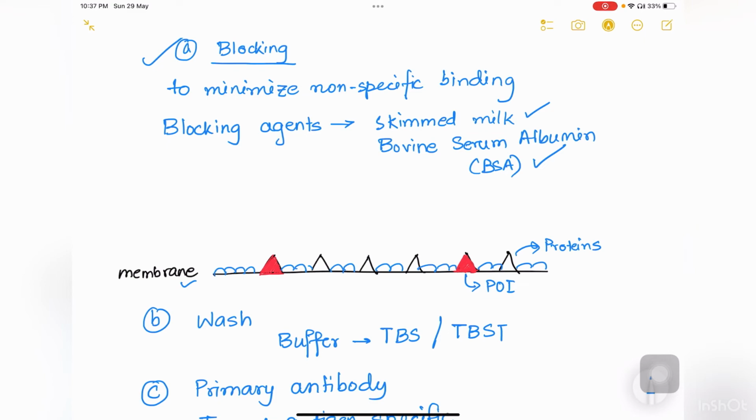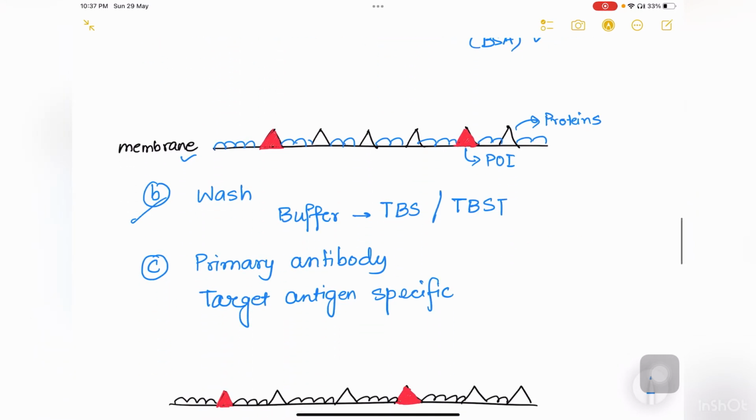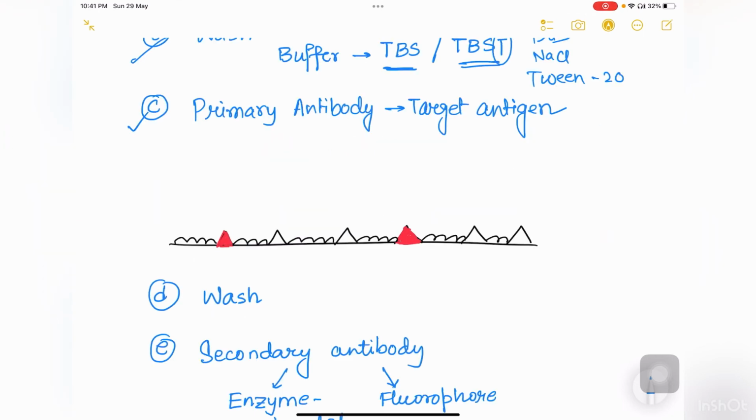Now, after this blocking step is done, we wash the membrane very well. Washing is done by buffer TBS or TBST. TBS is basically Tris and NaCl, and there is an extra T in TBST which stands for a detergent, a very mild detergent called Tween 20. This wash has to be very carefully done so that the excess blocking reagents can be removed. The next step is incubation with primary antibody.